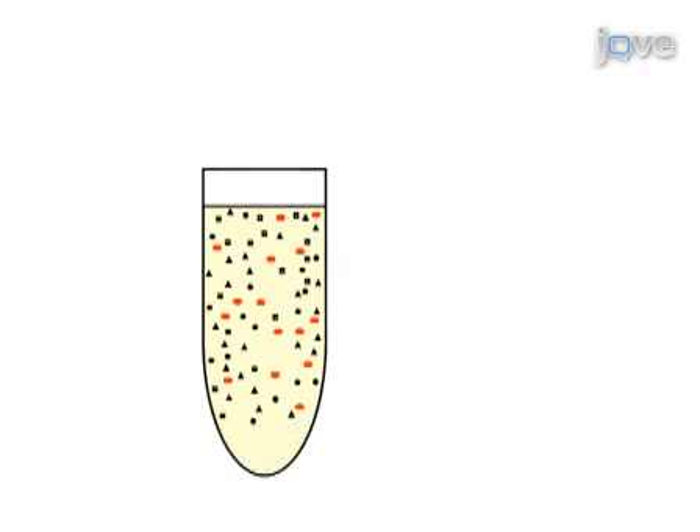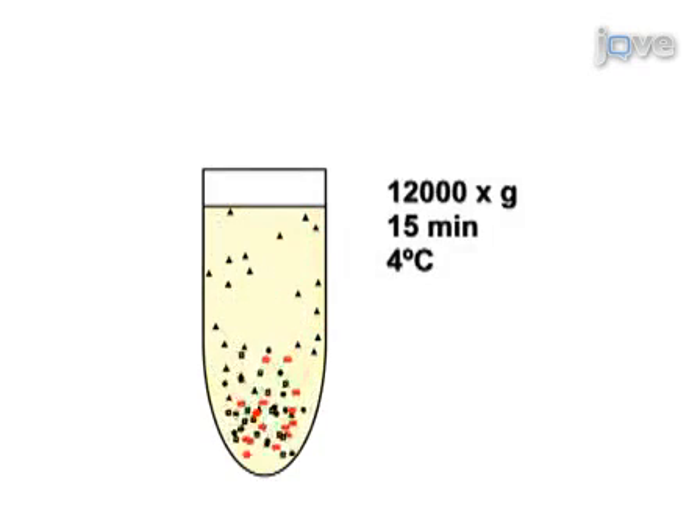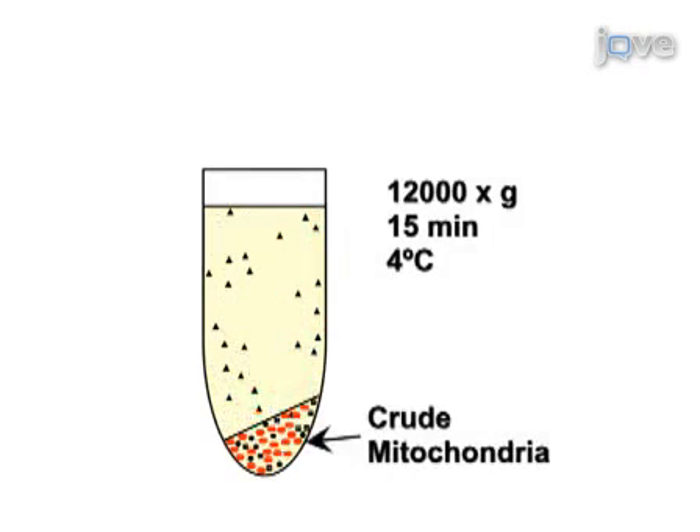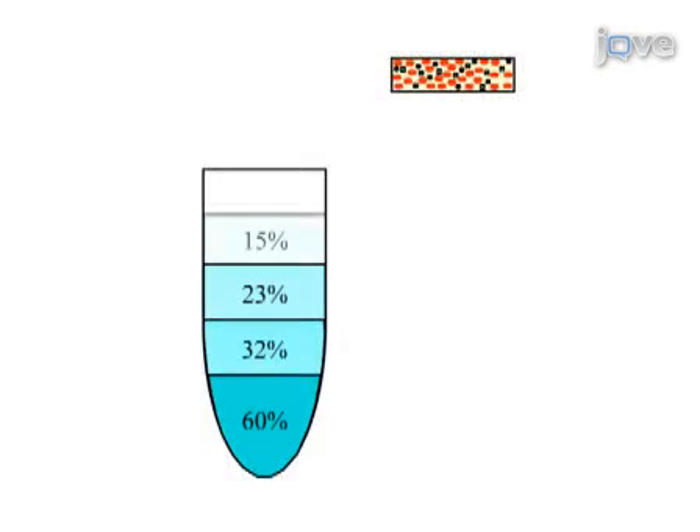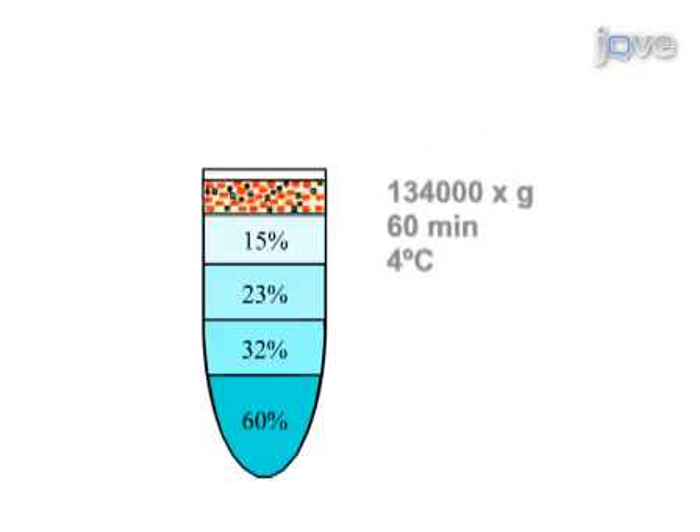Next, the resulting supernatant is centrifuged for 15 minutes at 12,000 g to sediment mitochondria. Finally, the crude mitochondrial fraction that still contains other organelles is subjected to centrifugation for 60 minutes at 134,000 g in a sucrose density gradient.